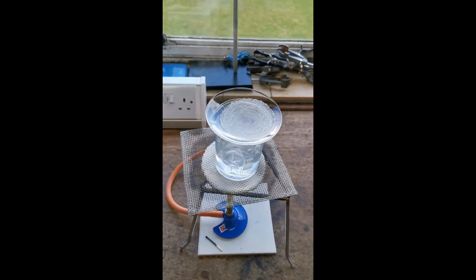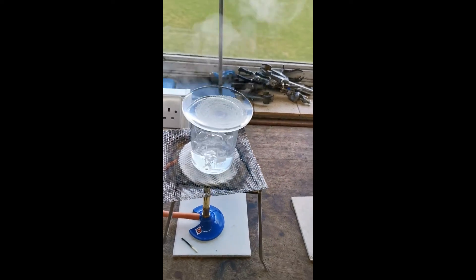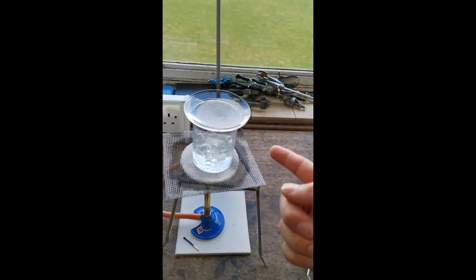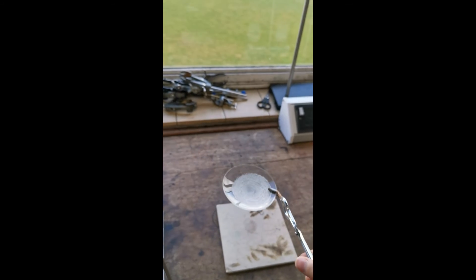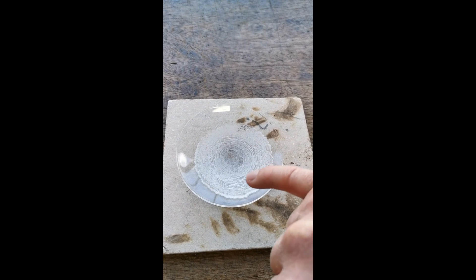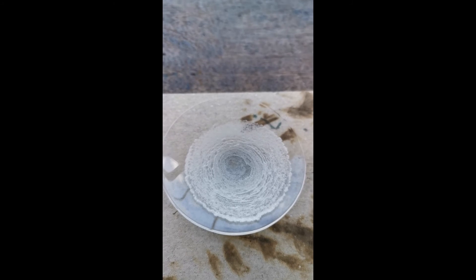Now that all of the water has evaporated from the mixture, we're going to turn the Bunsen burner off. We're going to very carefully, using tongs, remove the watch glass from the water bath — I don't want to use my hand because it will be very, very hot. So we're going to carefully grab it with the tongs and set it down on a heat proof mat, and leave it there to cool. After the watch glass is cool, you can now see that the salt has crystallized on the watch glass. There we have the salt produced from the neutralization reaction between sodium hydroxide and hydrochloric acid.